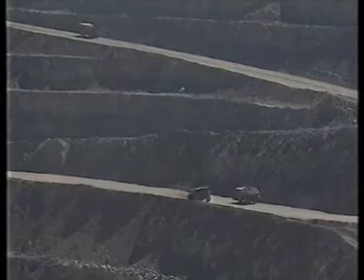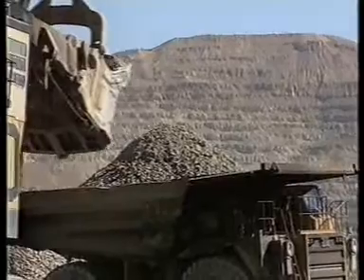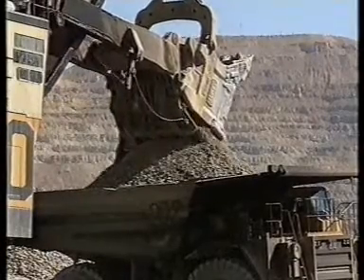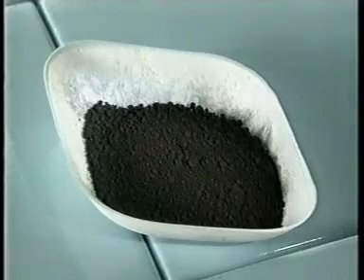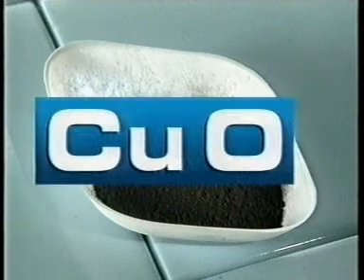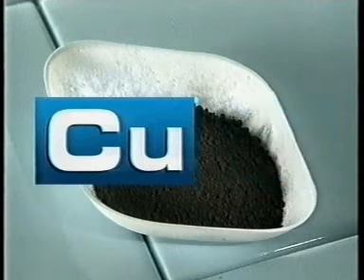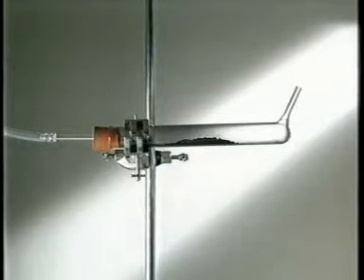But finding metals in their pure state is rare. Copper is usually found in rocks, combined with iron, sulfur and oxygen. This is copper oxide. To extract pure copper metal, oxygen has to be removed, a process known as reduction. One method is to use hydrogen as a reducing agent.